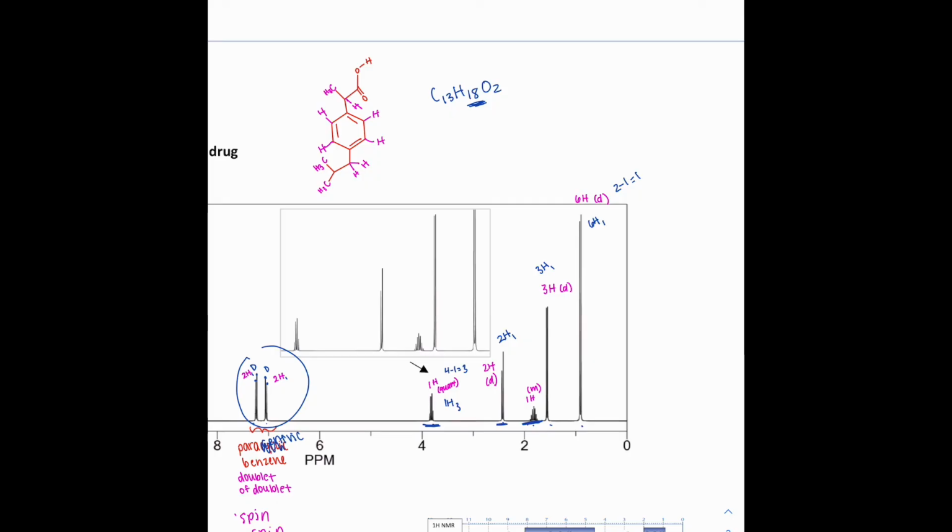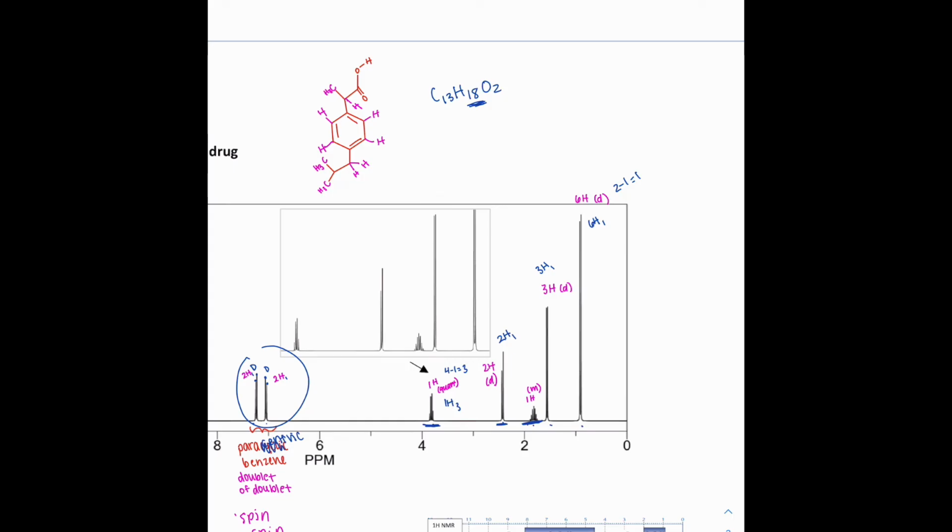So we know that we have 2 hydrogens in the signal, and there's going to be 1 neighbor. So if we look over here, we can ask, where do we have 2 hydrogens and 1 neighbor? These methyl groups wouldn't really work because there are 3 hydrogens, and they're in a similar environment, so we'd likely have a different integration number for that. So I think the match would really be these 2 hydrogens with this 1 neighbor.